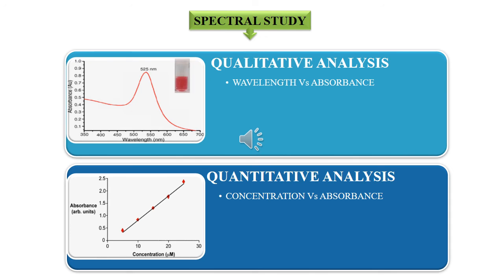You plot a calibration curve as shown in the figure, and once you plot the linear curve, we can get the sample concentration by means of extrapolation. This method is widely used to quantify samples.